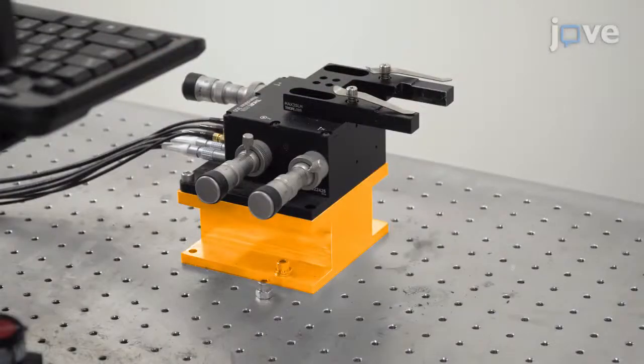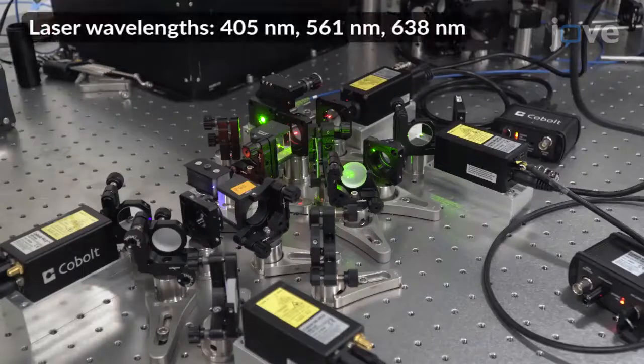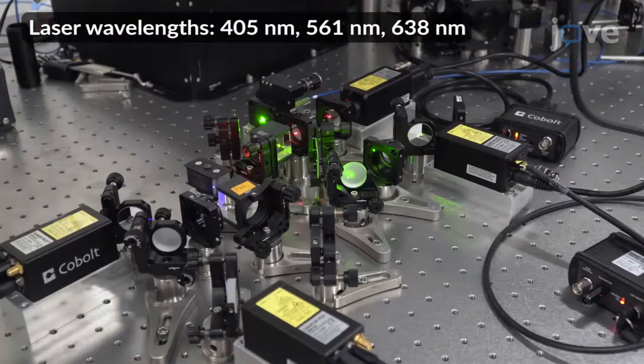Mounted on an aluminum block is a microscope body with a piezo stage and sample holder. Also on the bench are three lasers and optical elements to combine the beams.